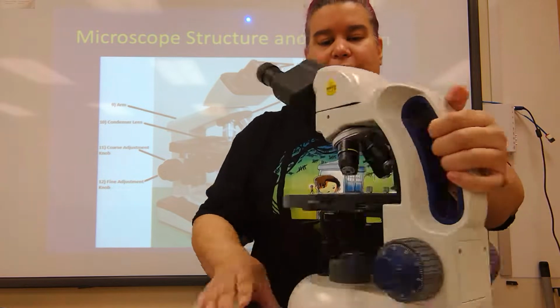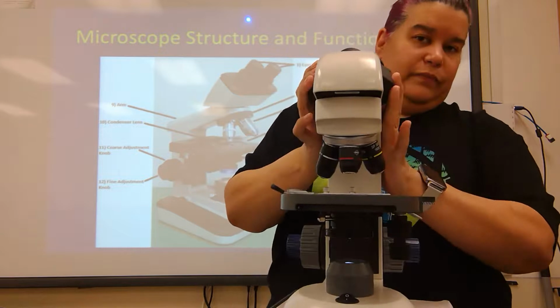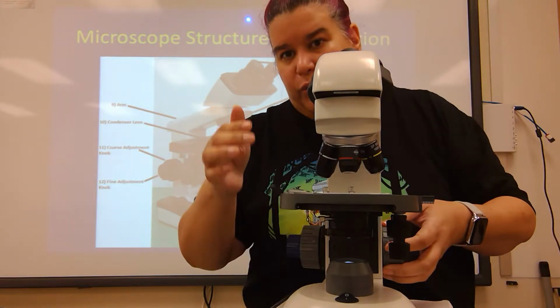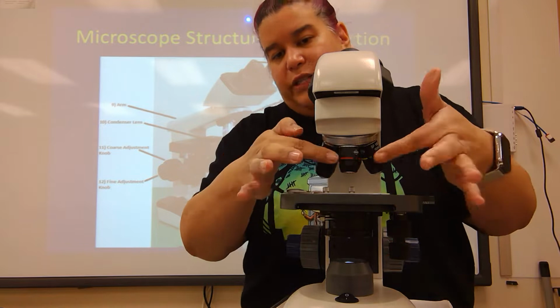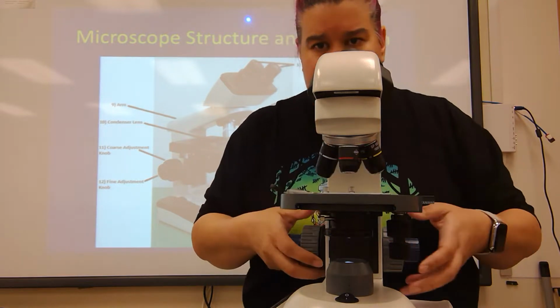The first time that you are using it, and you want to focus in on your slide, you will use the coarse adjustment and your lowest magnification, so 4x.